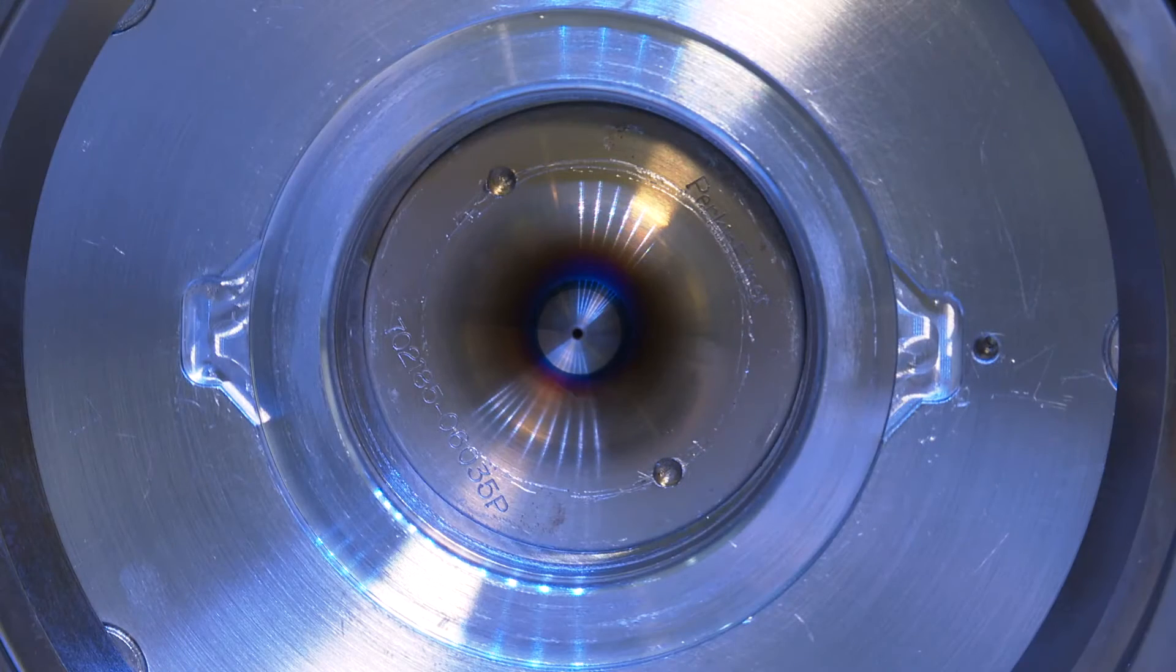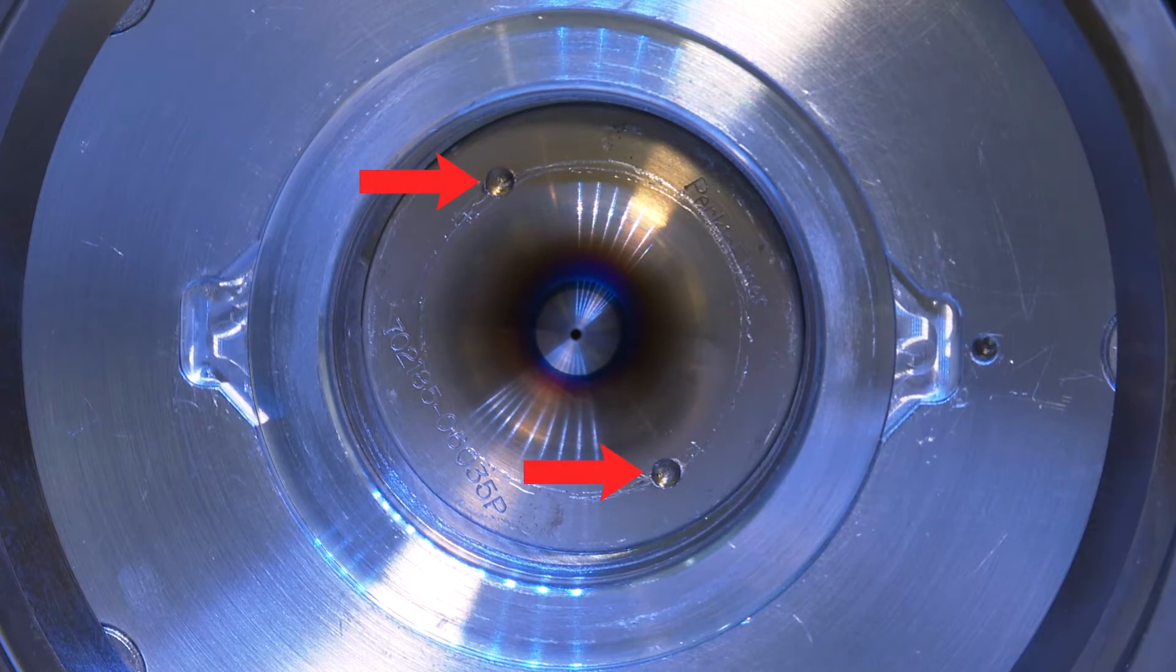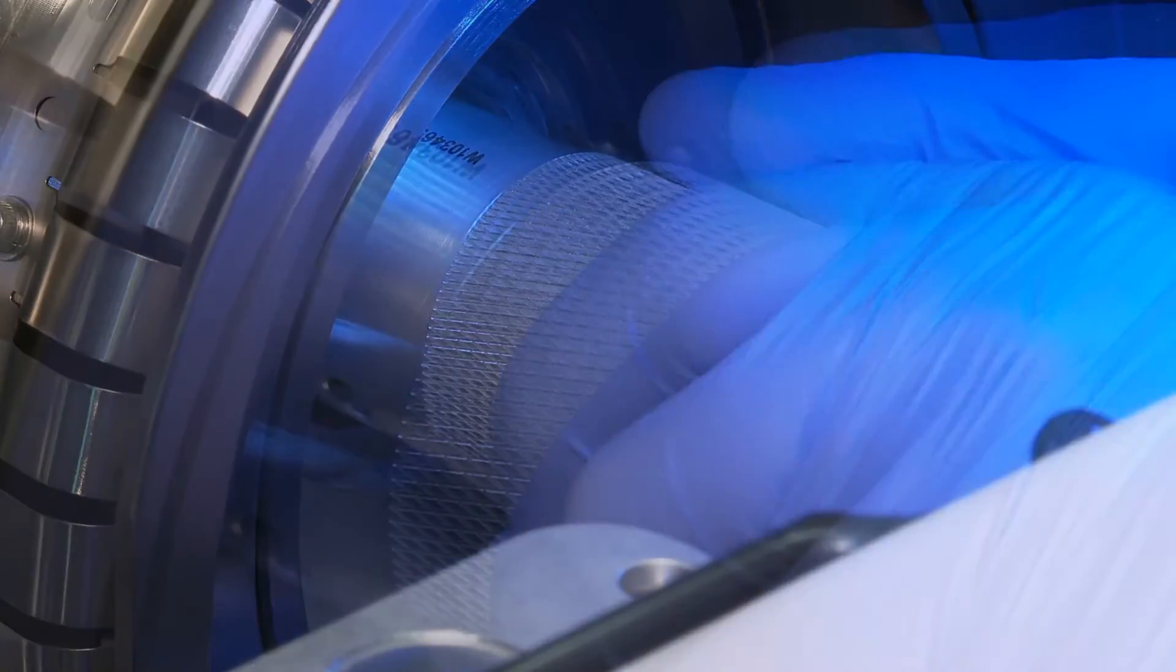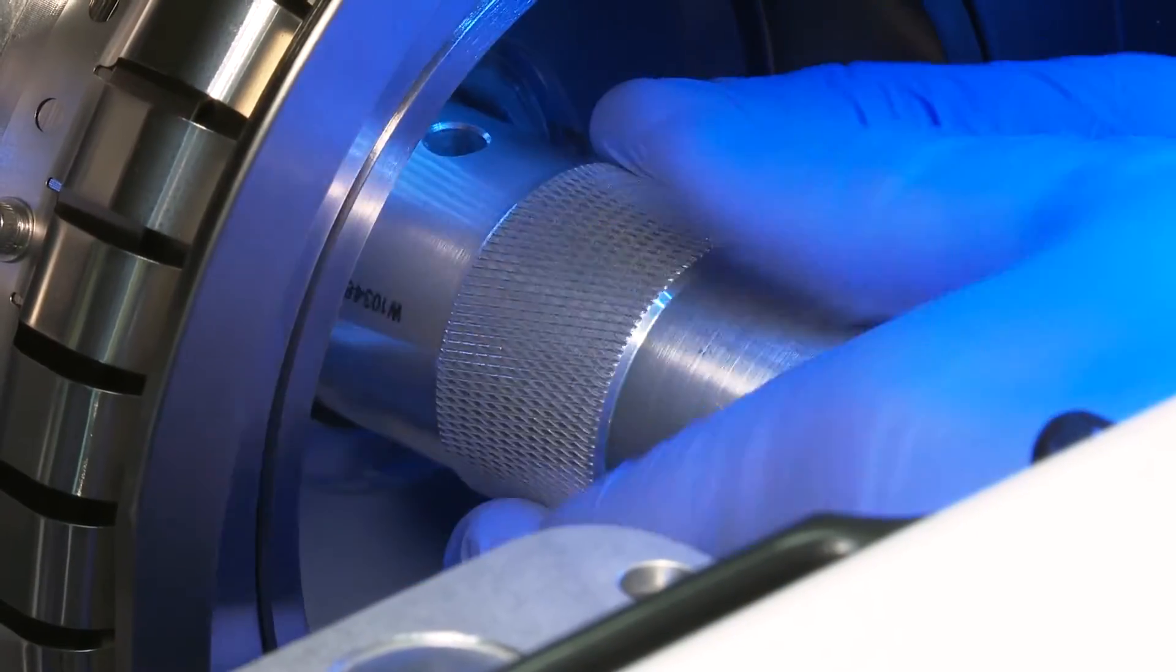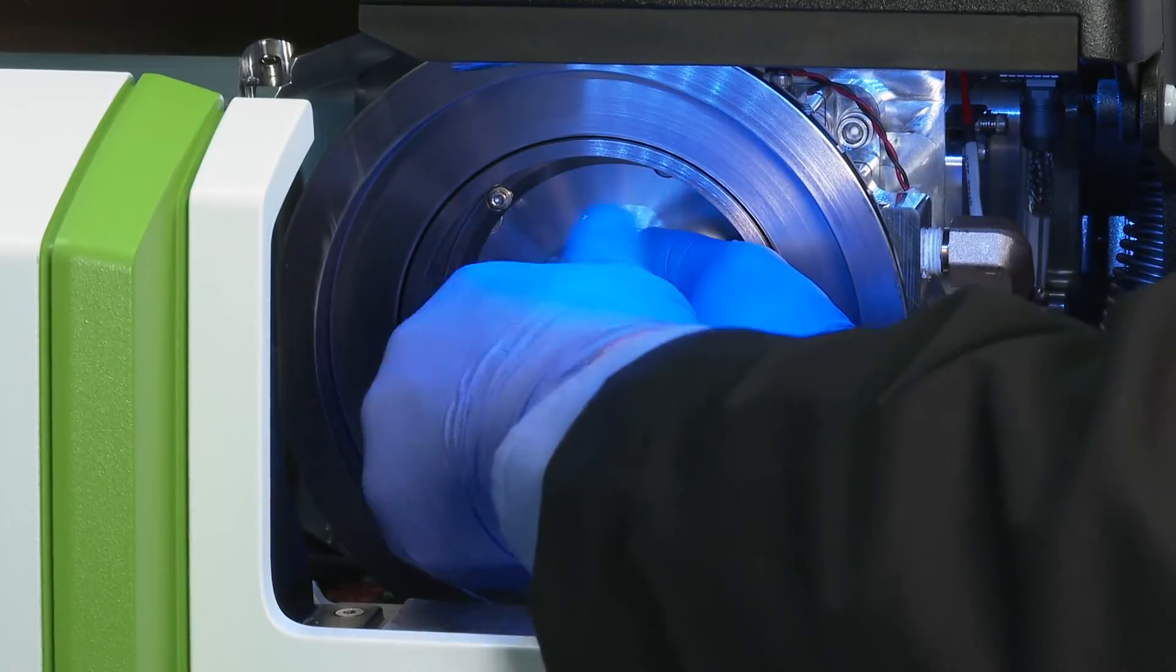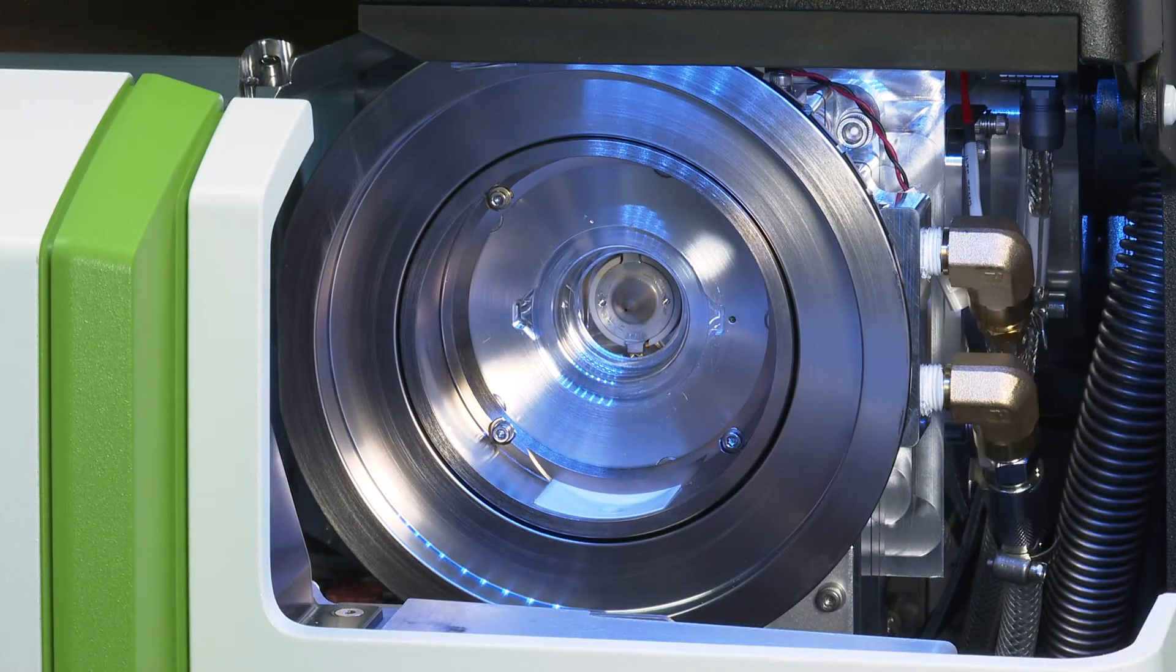To remove the skimmer cone assembly, insert the pins on the end of the cone removal tool into the skimmer. Once the pins have engaged, the magnets will secure the cone to the tool. Unscrew the skimmer by turning the tool counterclockwise, extracting both the tool and the skimmer. Place this cone on a clean work area next to your sampler cone.